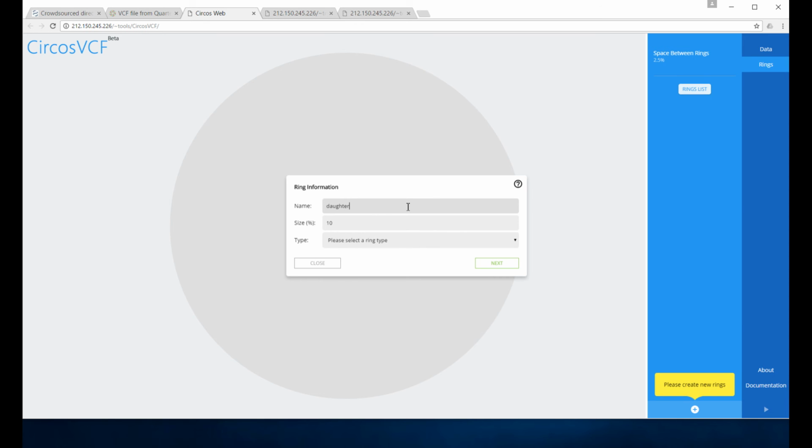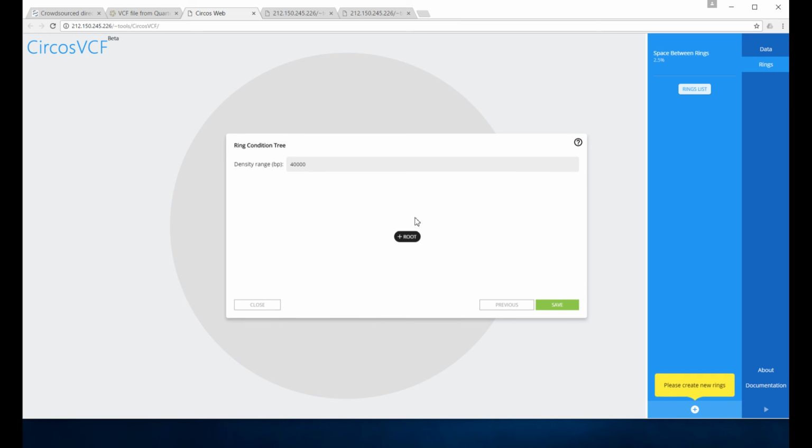Two options are available for representing SNP information. The first is the calculation of the number of SNPs within a defined genomic interval, where darker color on the plot represents denser regions. The other option is to draw a line in each SNP location, where each line is colored based on its genotype. In our demo, we will use the first option. Additional information can be retrieved on each analysis step by clicking the question mark.